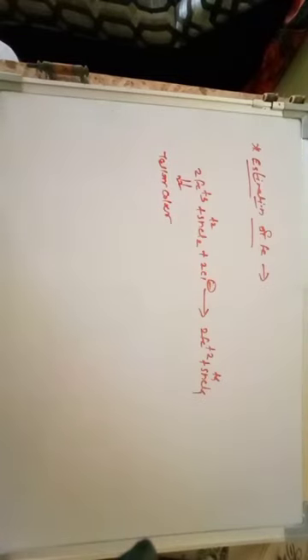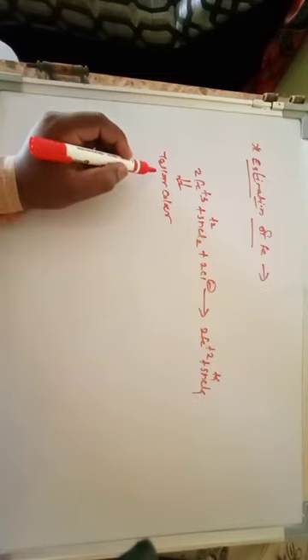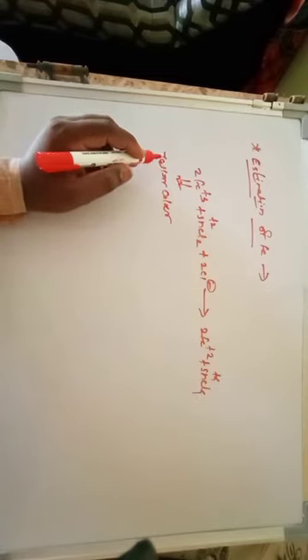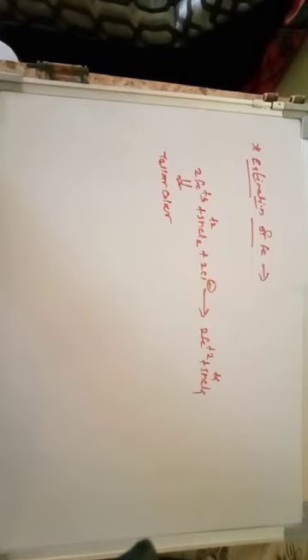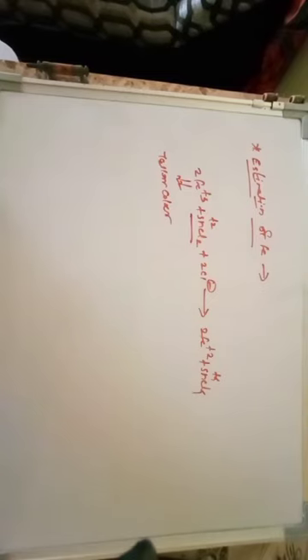It is a yellow-colored complex of FeCl3, and it disappears by the addition of tin chloride. The reaction is complete when the yellow color of the iron(III) chloride disappears, meaning the Fe3+ is converted into Fe2+. This is done with the help of the reducing agent, tin chloride, and the tin is converted into Sn4+, while Fe3+ is reduced to Fe2+.